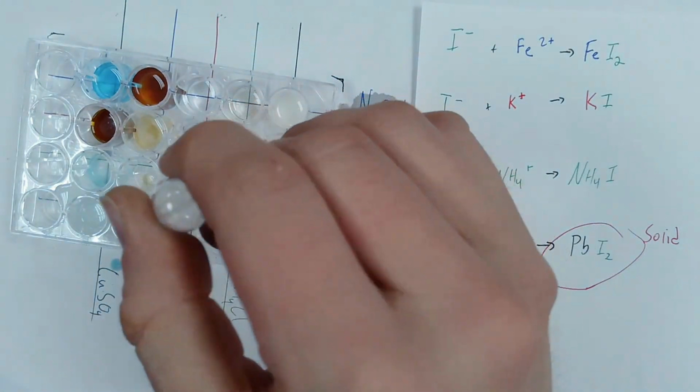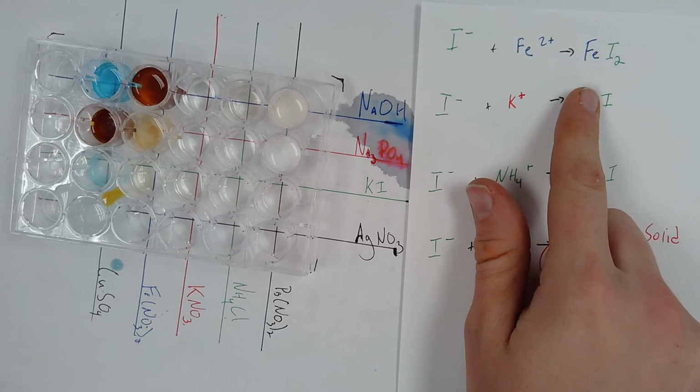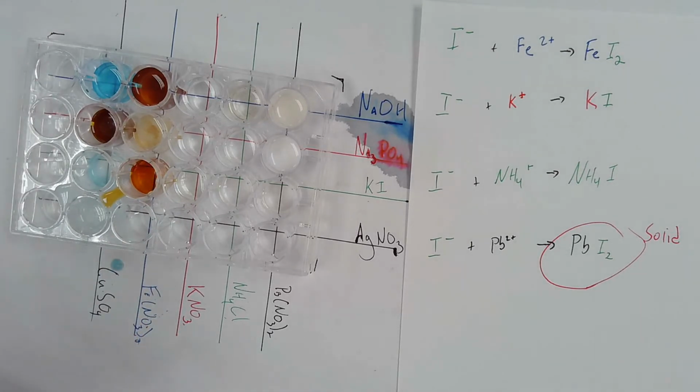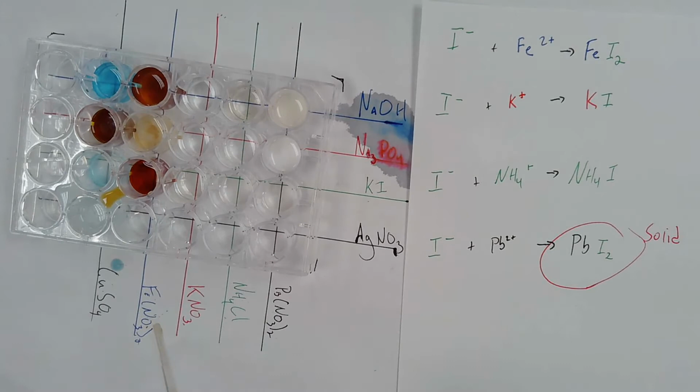Here, I've got some KI. Let's fill up all of our rows. And I want to combine them. Let's start with the iron. That's nice and easy. So we're predicting that this does not make a reaction. It looks like a reaction, Mr. Nendick. But here's the trick here. This is our first tricky one, right? And I want to get enough here to prove it to you, because watch what happens when I try to centrifuge this down. Check this out.